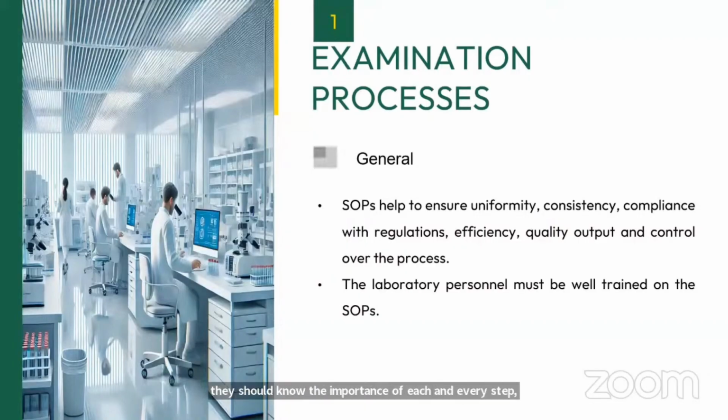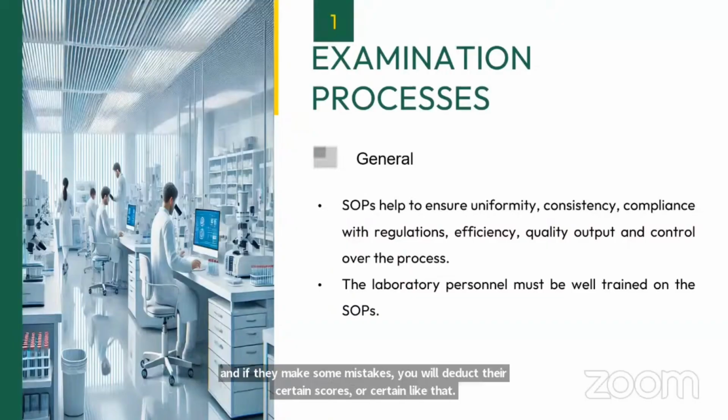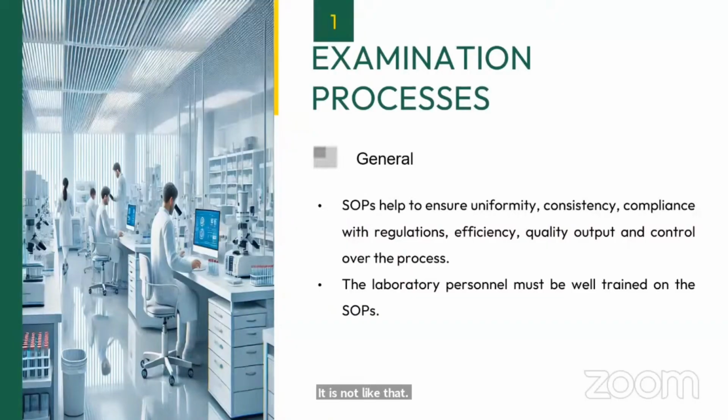As I mentioned, it is not at all mandatory that they should memorize those SOPs or learn them by heart, so that you will take some written examinations and if they make some mistake, you will deduct certain scores. It is not like that. It is expected that they should understand each and every part of each and every step of the standard operating procedure.